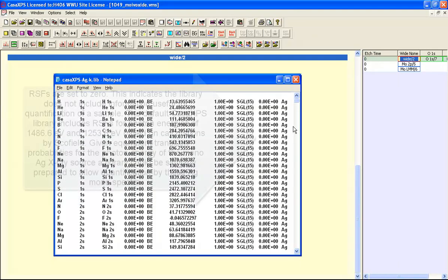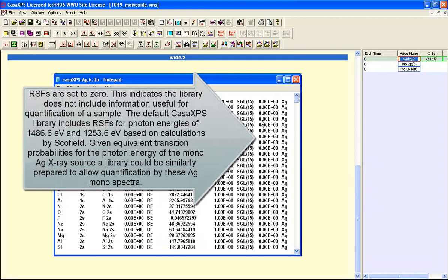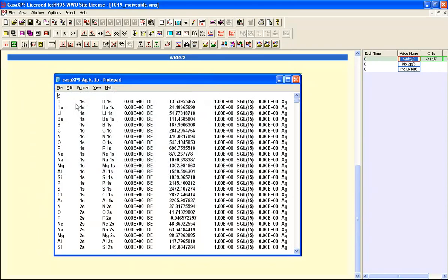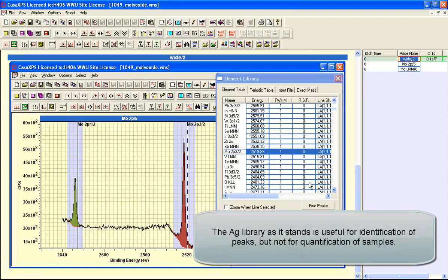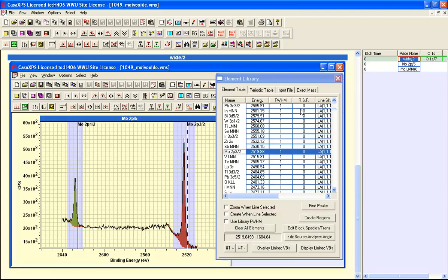This element library is primarily set up for the silver anode so that photoemission lines can be identified. The need to know that this is a molybdenum 2p rather than some other element is the focus of that library. All the relative sensitivity factors have been set to zero to indicate that they are as yet unknown to this library. So quantification would not be possible. However identifying these photoemission lines is useful, hence this library exists. But in terms of quantification that's work yet to be done.